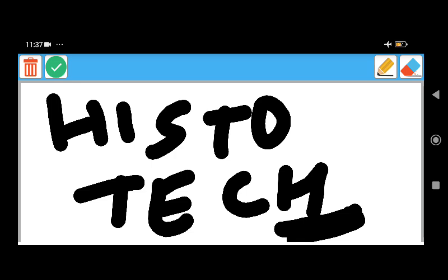Aqueous mounting media: glycerin jelly, apathy's medium. Resinous mounting media: Canada balsam, Venice balsam, synthetic resin, Kirkpatrick and Lendrum's DPX.